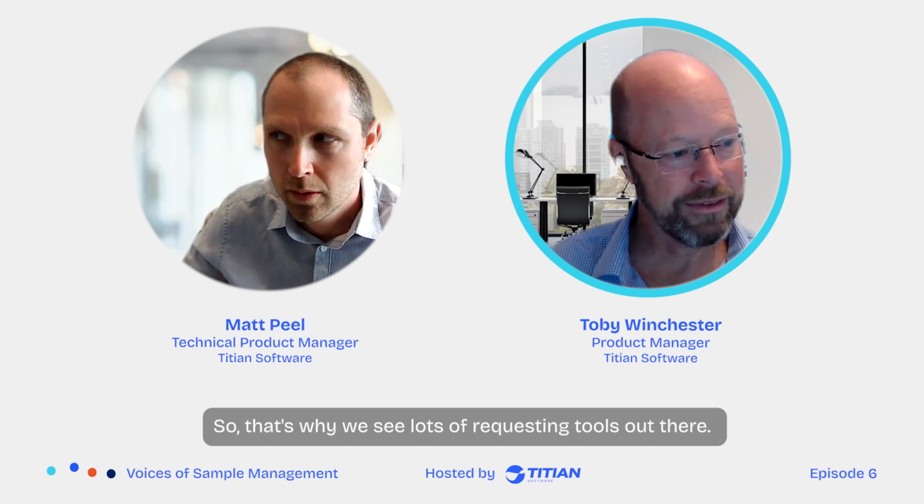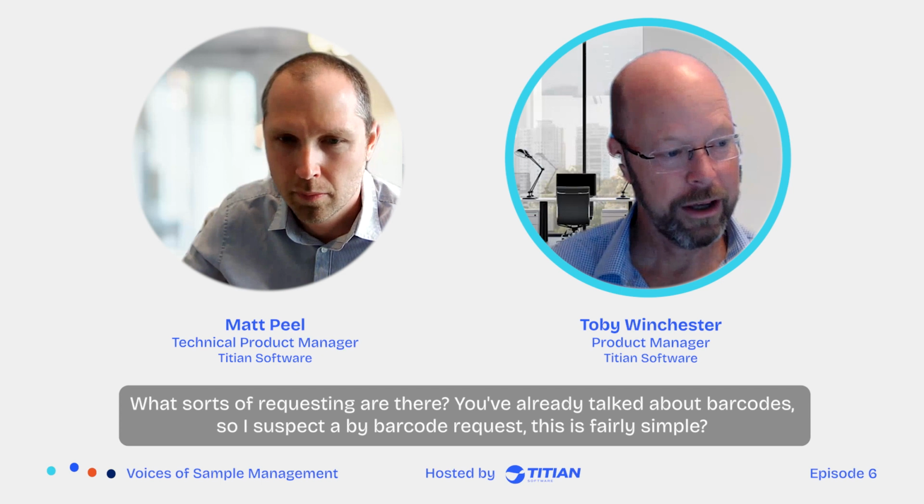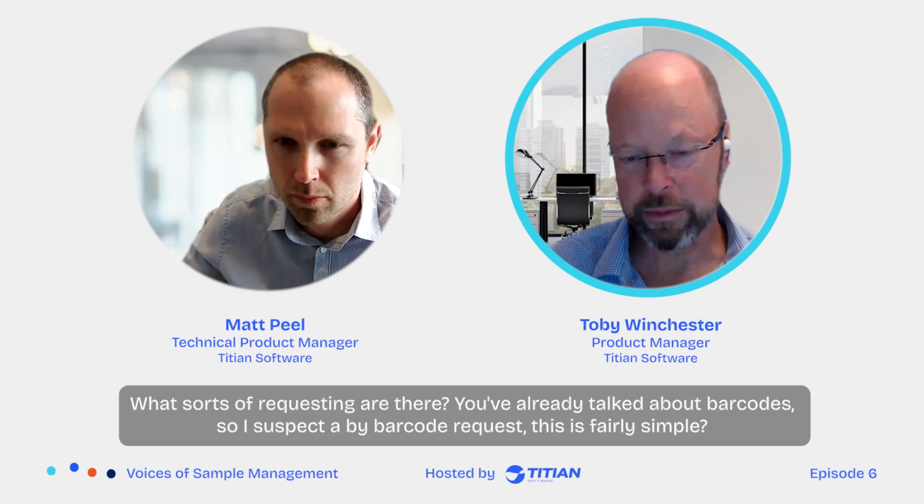So that's why we see lots of requesting tools out there. What sorts of requesting are there? You've already talked about barcode, so I suspect a by barcode request is fairly simple.